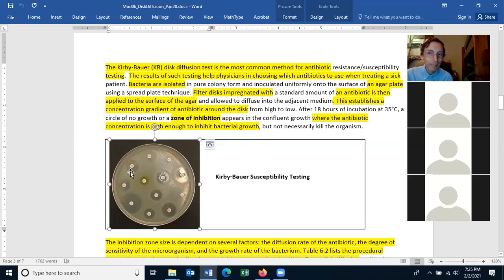Well, that way, because the disinfectant would just spread across the whole thing. Yeah, because we're really measuring the disinfectant's ability to diffuse from the disc. And that's not the way we use disinfectants. Generally, with a disinfectant, you put it on a rag and then you wipe down a surface.